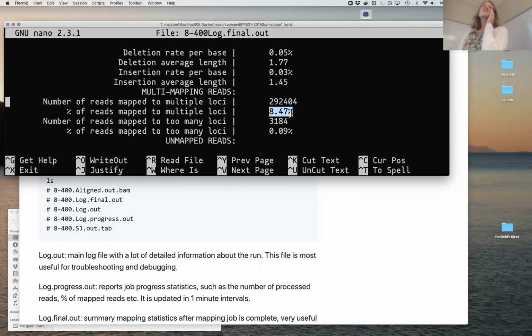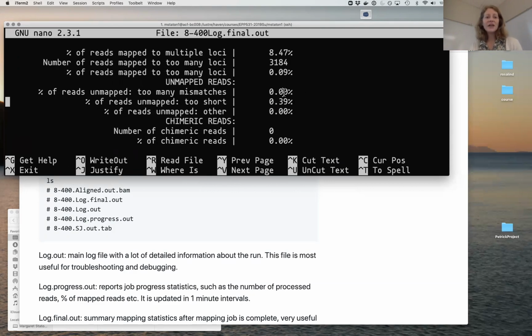Yes. Right. So tomorrow we'll deal with those multi-mapped reads statistically, and in this class we're just going to throw them away. But there are smarter ways to deal with them. In this case, reads that map to multiple locations have definitely been output in the SAM file, and all of those locations are in the SAM file.